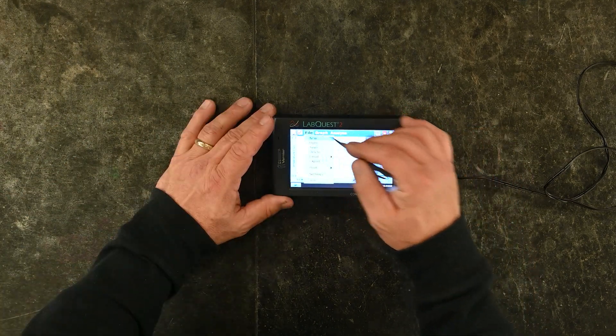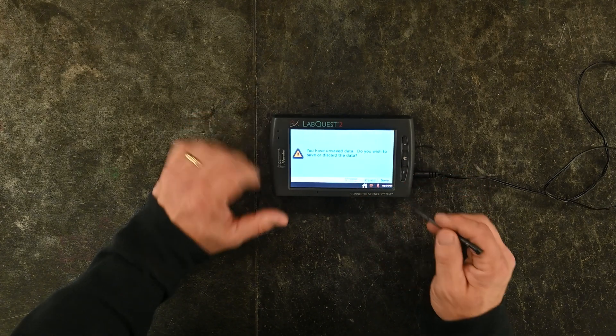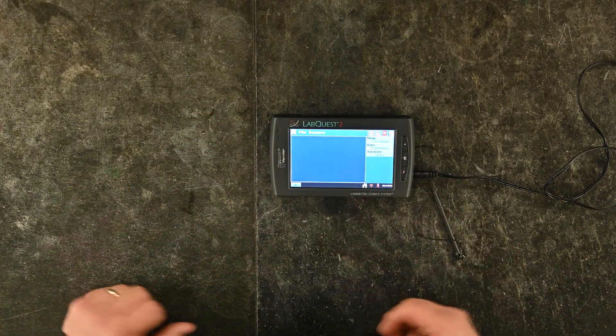To set up the SpectroVis Plus, first unplug the temperature probe, then go to File, New, and discard your data so you're back to a blank screen.